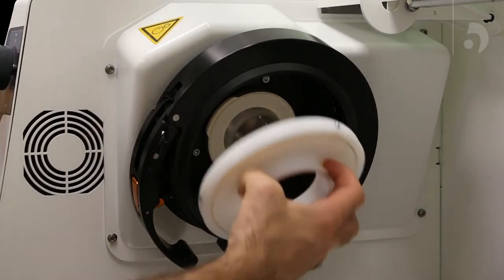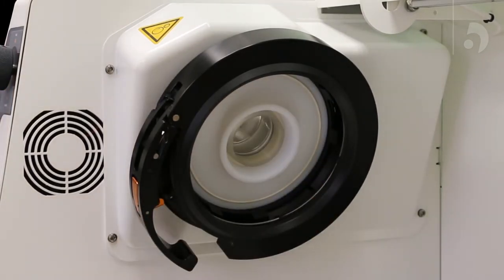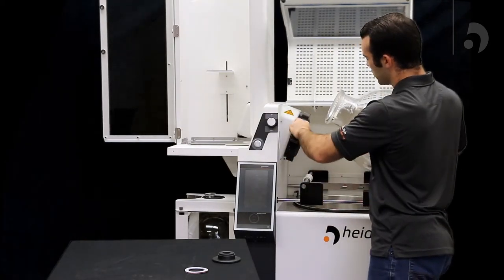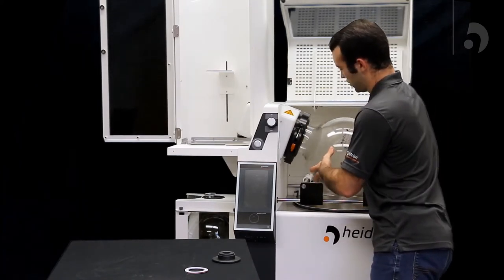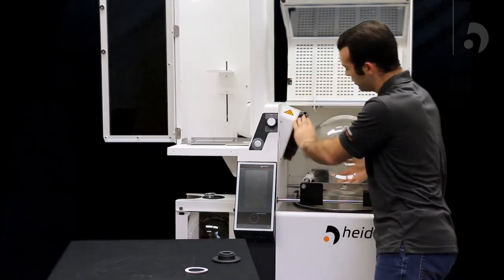Now we can add the PTFE seal adapter. Then from there, you can take our 20-liter flask, making sure the easy clamp is open, and slide it in. Once you have it in, pull up on your clamp and push down to lock it.